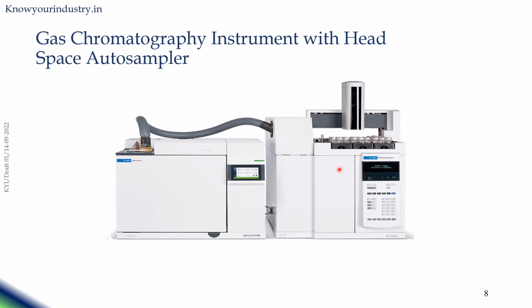This is the most commonly used instrument for the analysis of volatile organic compounds, including solvents which have a low boiling point.